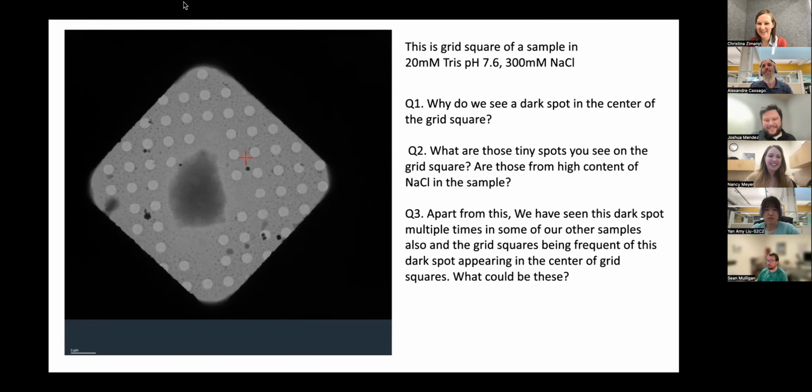Does everyone think those really dark, smaller spots are ice, like snowflakes? Like little ice crystals or ice contamination? Only the dark ones. The dark ones, yeah. I think the smaller ones are where it's just kind of dry. Yep, agreed, heated up. Actually, can you see my mouse cursor? Yep. Okay, so these very dark things, to me, look like ice. But then there are these little smaller dots, which are sort of ice microcrystal versions of this.